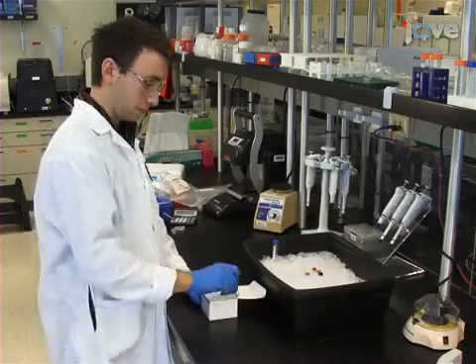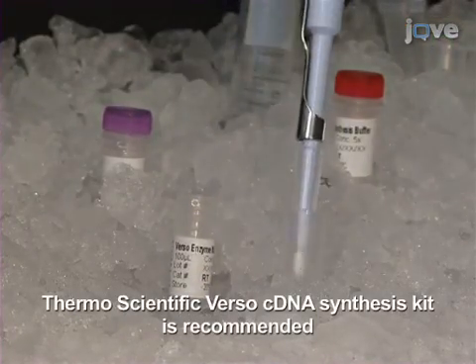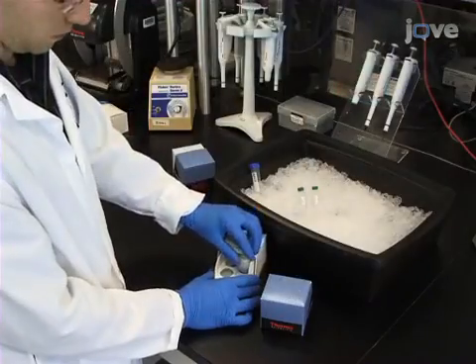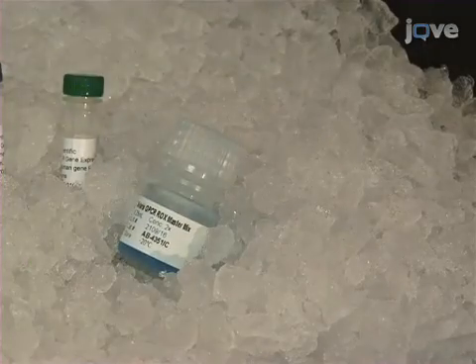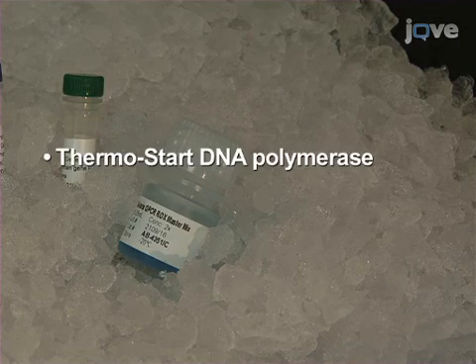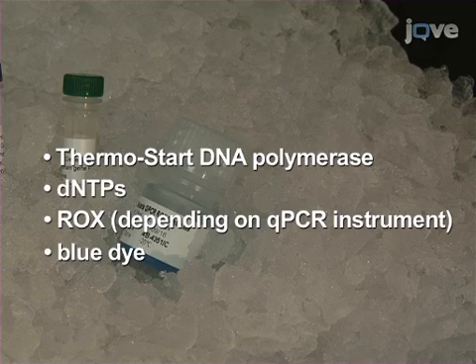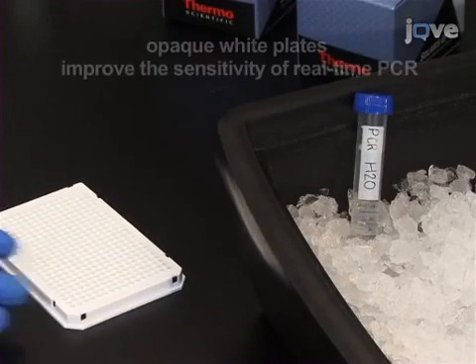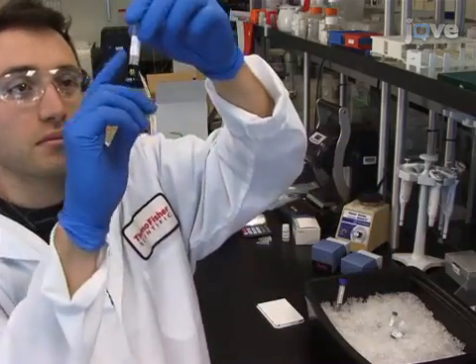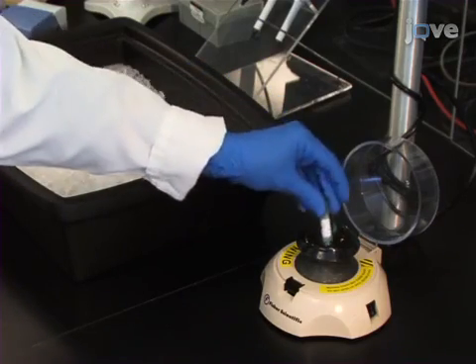Prepare cDNA for qPCR by performing reverse transcription reactions on sample RNA. Once the cDNA has been prepared, thaw the Solaris assay and master mix on ice. The master mix contains all components for quantitative PCR except the gene-specific assay and template. Components include thermostart DNA polymerase, dNTPs, ROX if the qPCR instrument requires it, and a proprietary reaction buffer containing an inert blue dye. Also have on hand PCR-grade water and qPCR plates. Once solutions have thawed, mix by flicking, then briefly spin the solutions down to prevent loss of reagent.